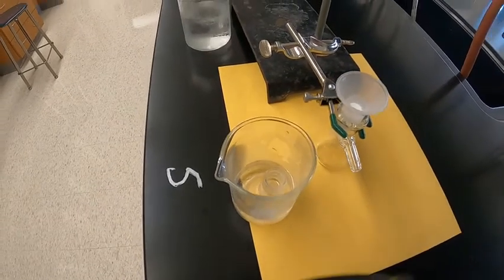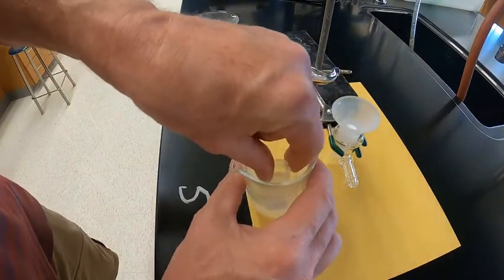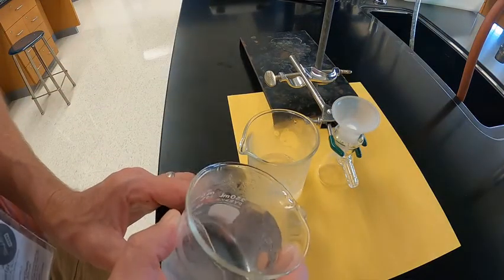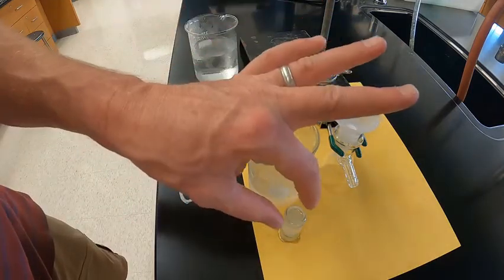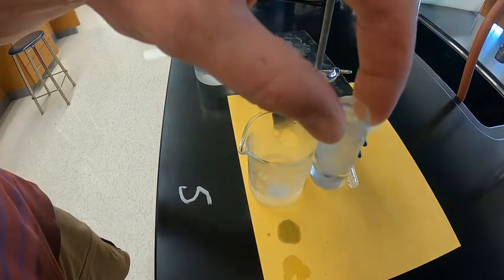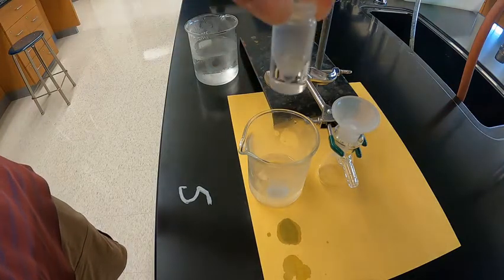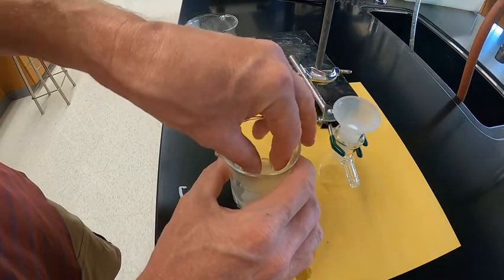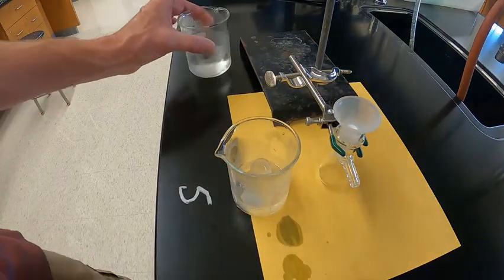So I have it in the cold water bath, and what I'm going to do is add a little more water to cause all the product to precipitate out. So now, if you look close, you can see a lot of cloudiness in there, and that's all the product has started to precipitate out and settle to the bottom. So I'm going to put that back in the cold water bath and set that aside so we don't lose it. So the cold water bath has ice in there. So now I'll just let it chill.